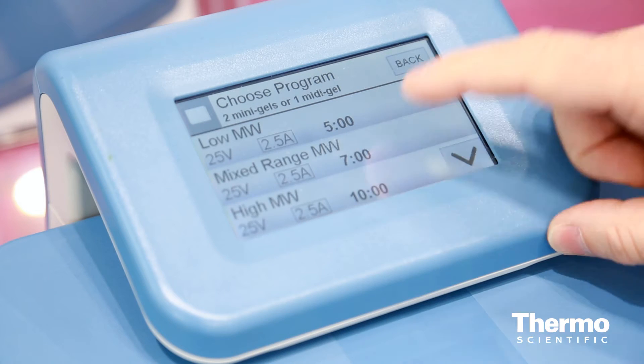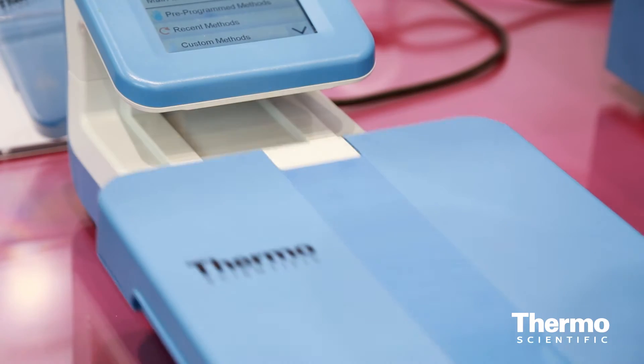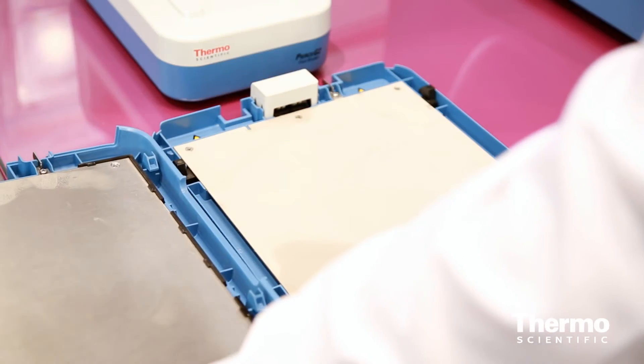The blotter is made of two parts: the control unit with a colored touchscreen, and a removable cassette which is also made in two parts, containing the two electrodes — the anode and the cathode — which are crucial for a good transfer from gels to membrane.